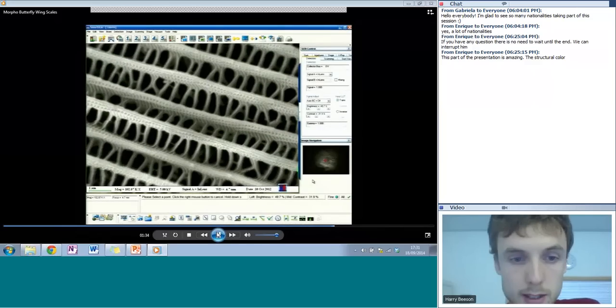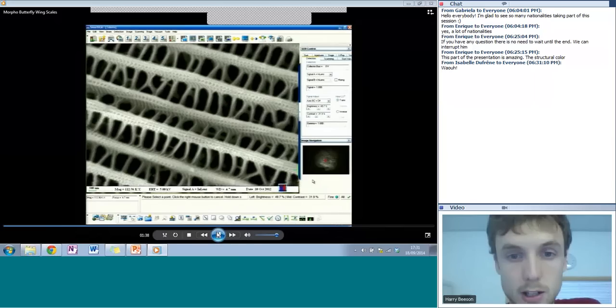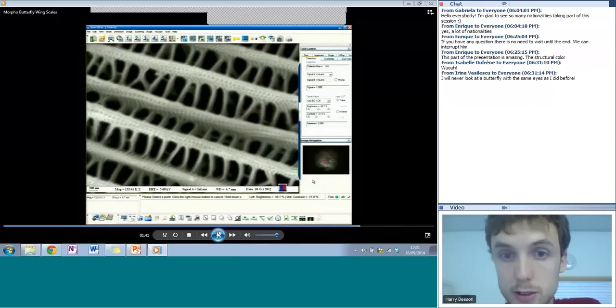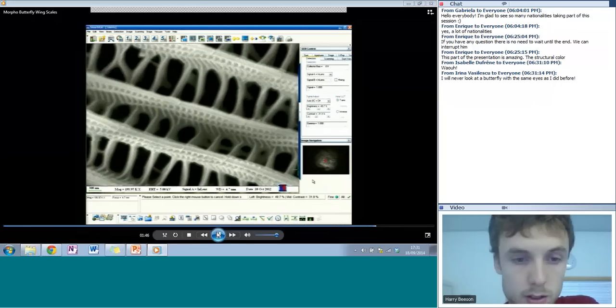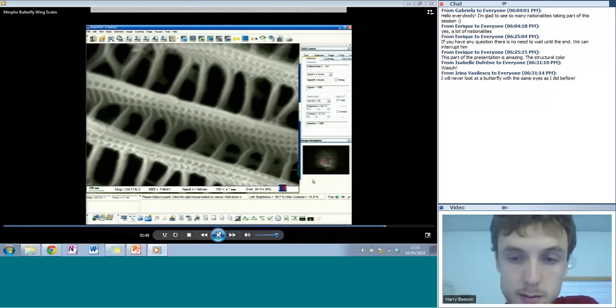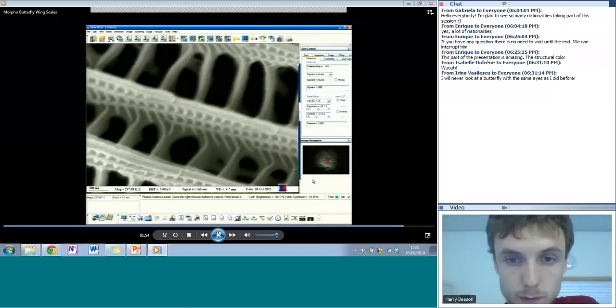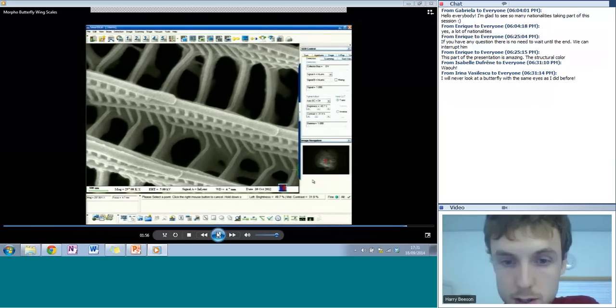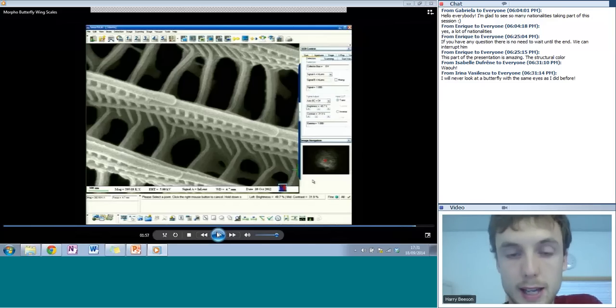And you can see here just how zoomed in you can get with the electron microscope. So this is going far beyond the resolution that you'd be able to achieve with an optical microscope. You can see the scale bar now has gone to 300 nanometers. And then just a bit of focusing at the end, you can get really quite a nice, clean picture. It's also amazing how intuitive, in a way, it is. I mean, that essentially just looks like a picture of what you're looking at.